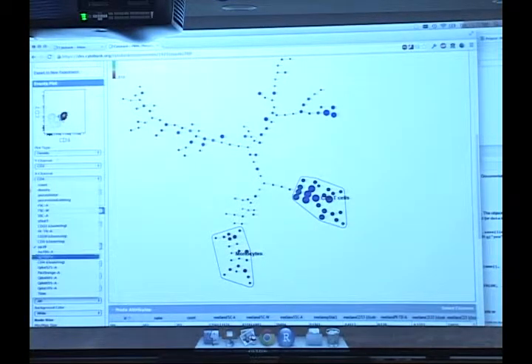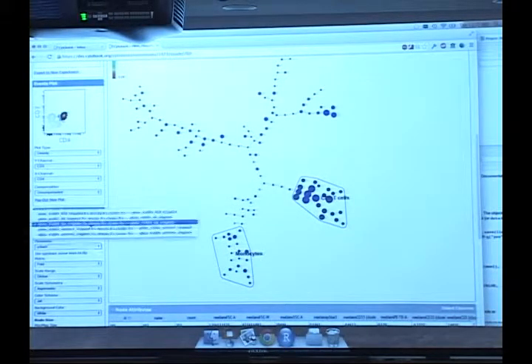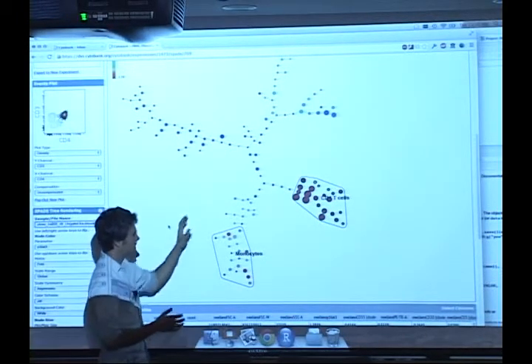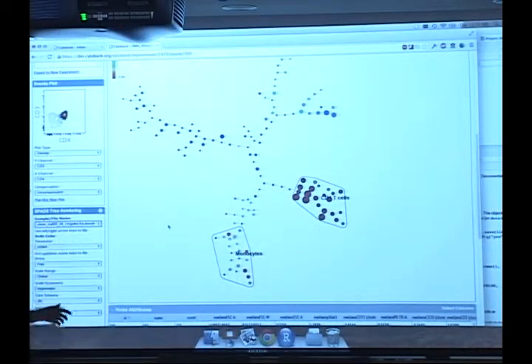So we can do something else. Let's look at STAT3 response. There's not a lot of STAT3 response in LPS stimulated cells. But if we look at IL-6 stimulation, we can see that in our IL-6 conditions, the CD4 T cells have very high expression of STAT3 relative to our unstimulated baseline.